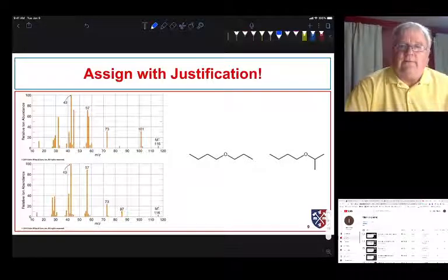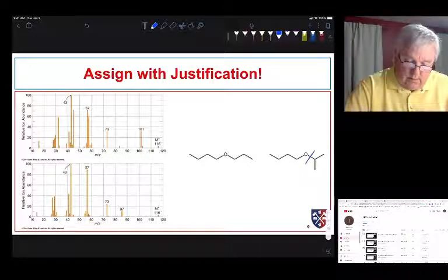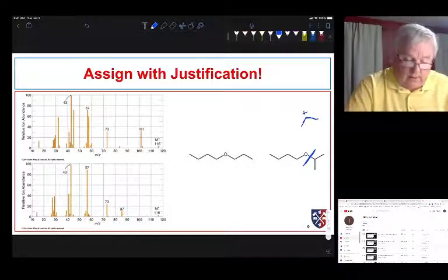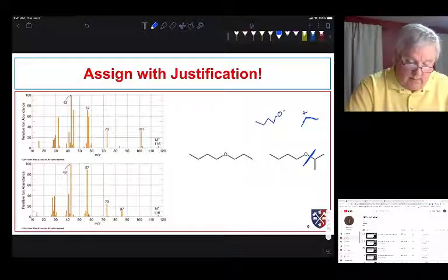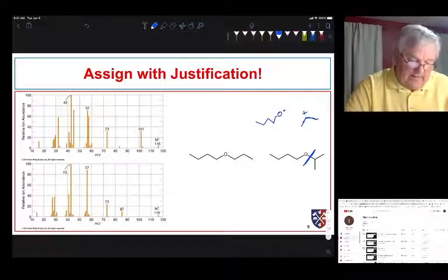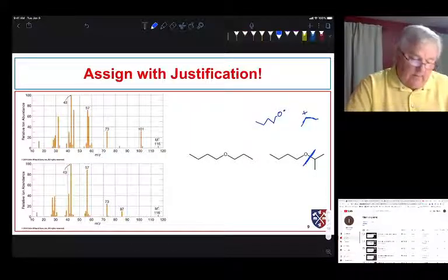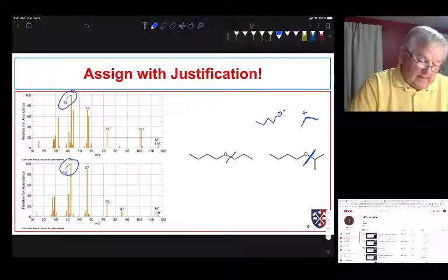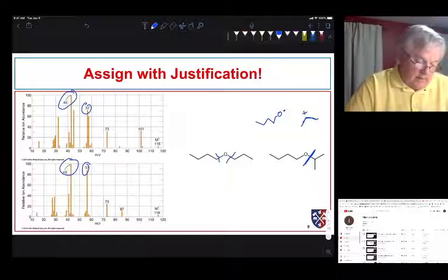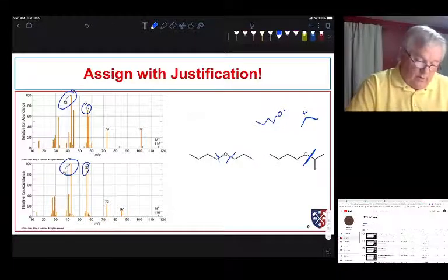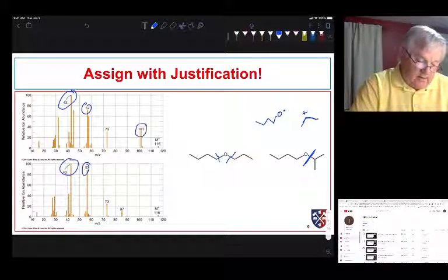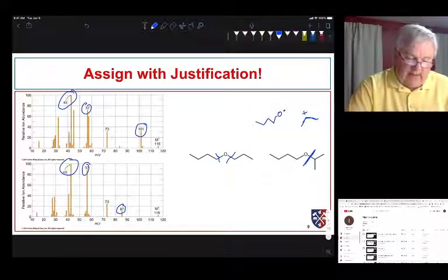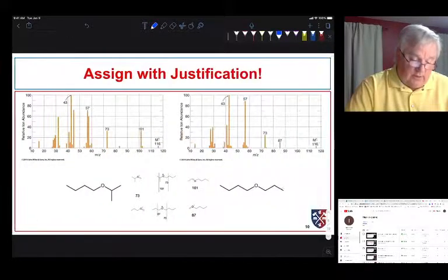Different functional groups cause different types of fragmentation. For ethers, we might expect fragmentation of the carbon-oxygen bond. We do see some of that, and we see a large peak at 43 in both spectra. But notice the differences: one spectrum has a large peak at 101 and another has a large peak at 87. Ether groups like to fragment in such a way that they cleave the bond to form a carbocationic center next to the oxygen.